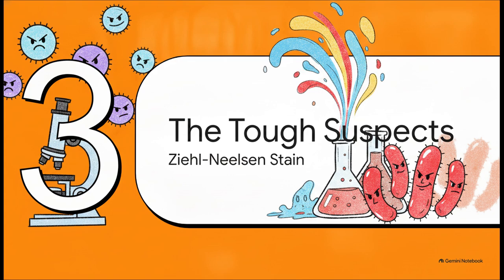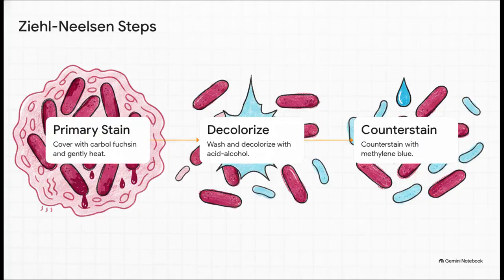You know, sometimes our standard interrogation tactics completely bounce off, which means we have to call in a specialized approach. Some organisms totally ignore the gram stain. They have heavily armored cell walls packed full of mycolic acids, acting almost like a thick, waxy raincoat. Normal stains just beat up and roll off. So we have to literally steam the primary stain, carbol fuchsin, right into them using gentle heat, being careful not to boil or dry out the specimen.